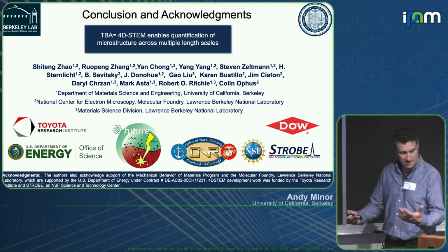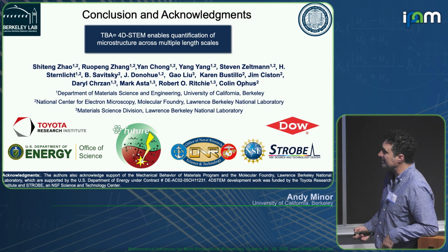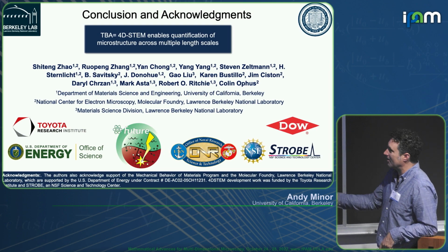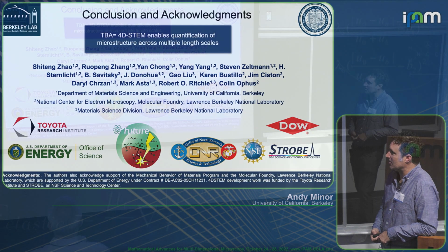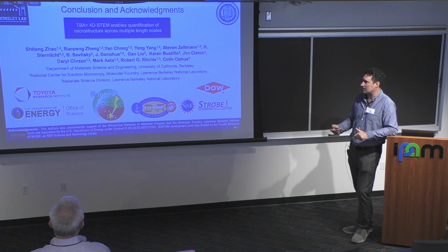Okay, so with that, my talk, TBA, I'm not sure what TBA stands for, but I will say 4D-STEM enables quantification of microstructure across multiple length scales.